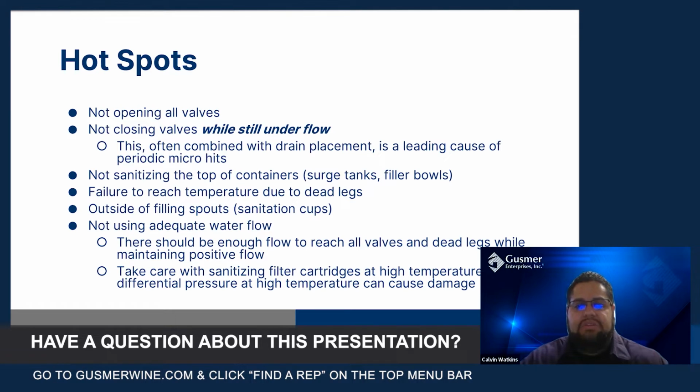When you're sanitizing though, if you use filter cartridges, be careful that you're not using a high flow rate with high temperature. Especially with filter cartridges, because a high pressure differential and high temperature can cause damage to polypropylene. So that's a good note there.